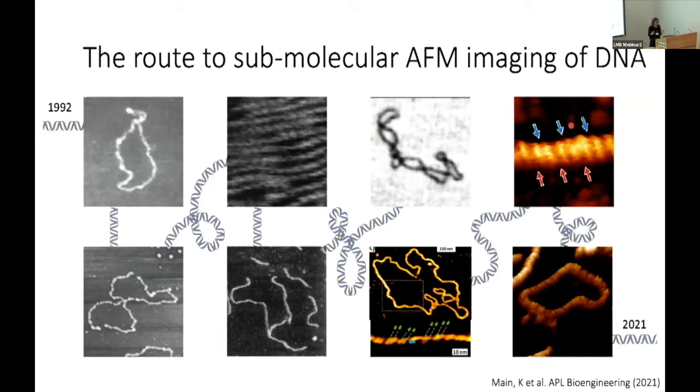And anyone in this lab that's used home-built systems for very complex biochemistry work knows that the likelihood of those two working together at the exact same time can be quite low. So we did a lot of work here with a manufacturer trying to move some of the amazing step forwards that had been made in instrumentation onto commercial equipment, so we could start improving the throughput of our experiments and actually trying to interrogate biological samples. And that's what happened quite recently.